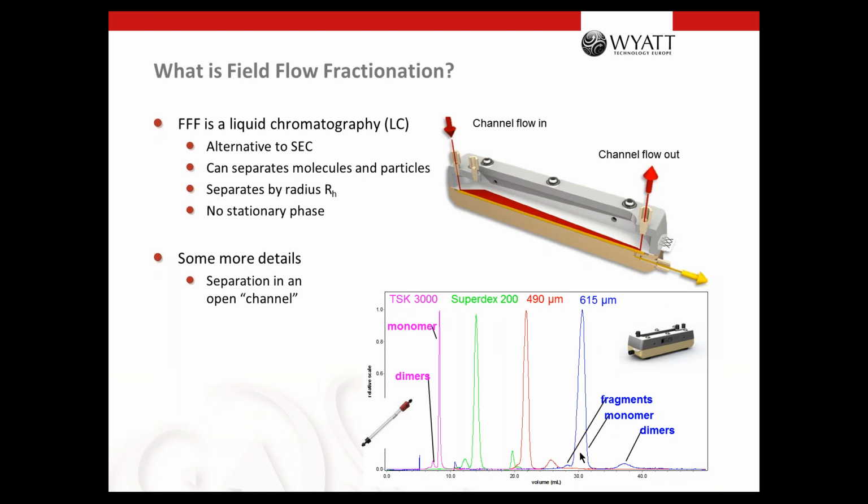And when we increase the separation even further, you could even separate fragments from the BSA, which is not possible with classical SEC columns, but in our days with the newer UHPLC SEC columns, you can also separate this fragment from the main peak.